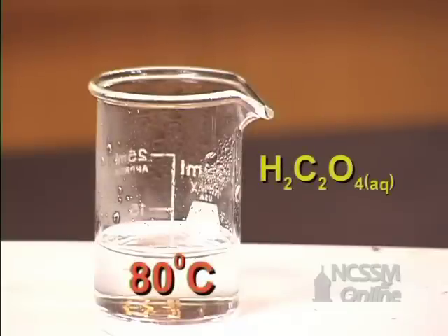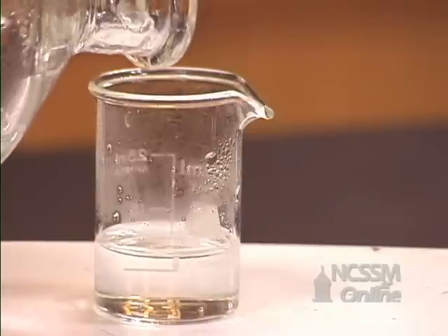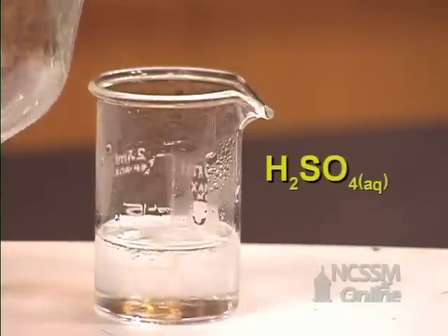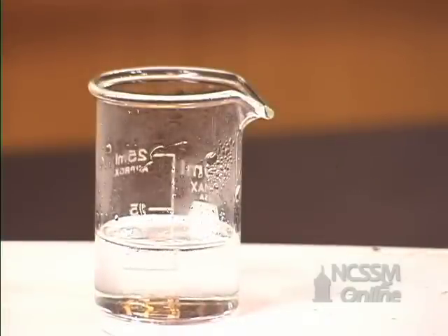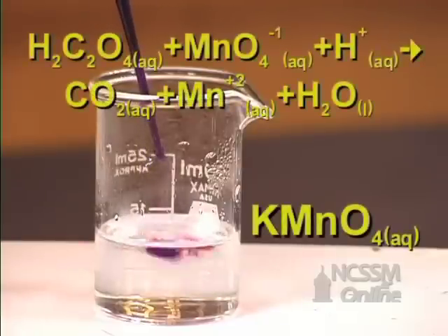We place the oxalic acid solution in a beaker and warm the solution to 80 degrees Celsius. We'll add a little bit of sulfuric acid to the solution. We will then add potassium permanganate.